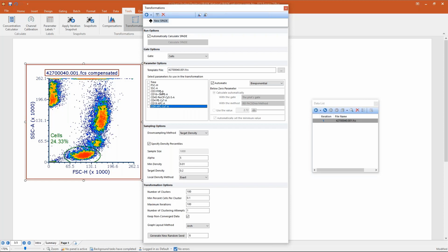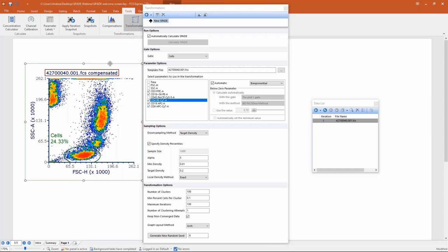So when you need to define which parameter to include, always ask yourself the following question: is this parameter giving me some advantage? So, is it informative? And of course, there is not a universal answer. For example, what about forward scatter, side scatter? What about CD45? What about whatever? So usually when I present this, there is a question that always comes up.